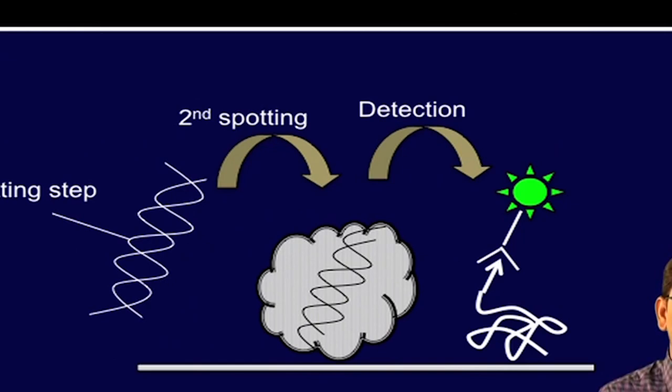Overall, in MIST technique, the DNA template is spotted in the first step followed by the cell-free lysate in the second step, which is directly added on top of the first spot. The expressed protein is detected by using fluorescently tagged antibodies. The inventors of MIST technology reported that even 35 femtogram of PCR product was sufficient for expression and detection of wild type green fluorescent protein. High density arrays containing 13,000 spots per slide can be achieved by using MIST technology.